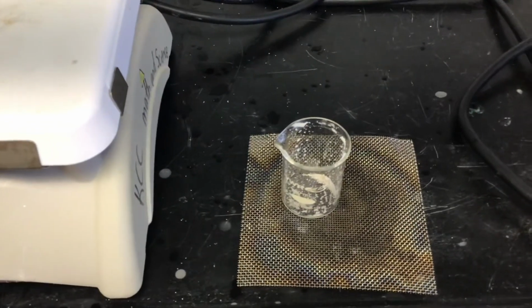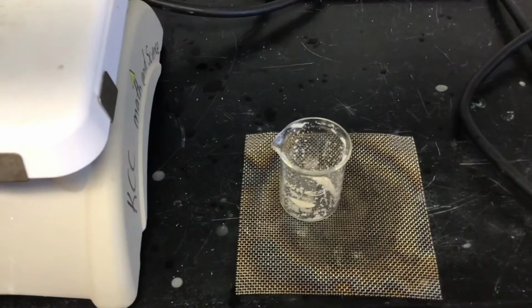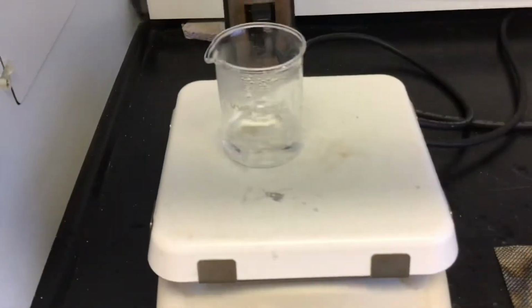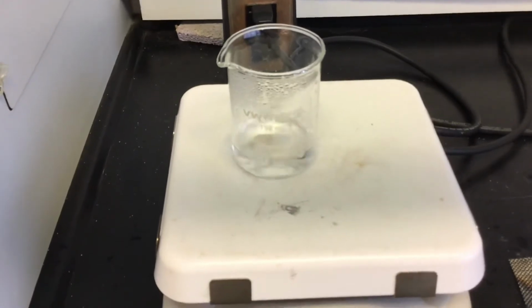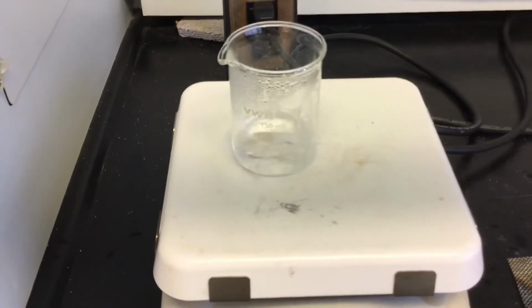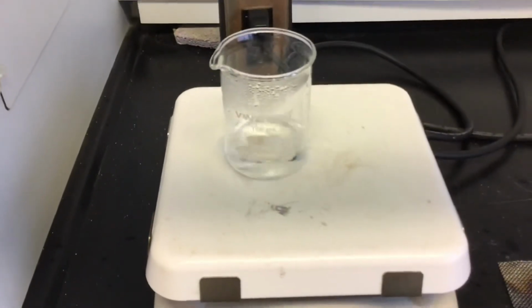Okay, we're going to let that cool, and I'll move it by the balance so when it's cool we can take that measurement. We still are waiting on all that water to evaporate for the salt water. Okay, so we are waiting for that process.